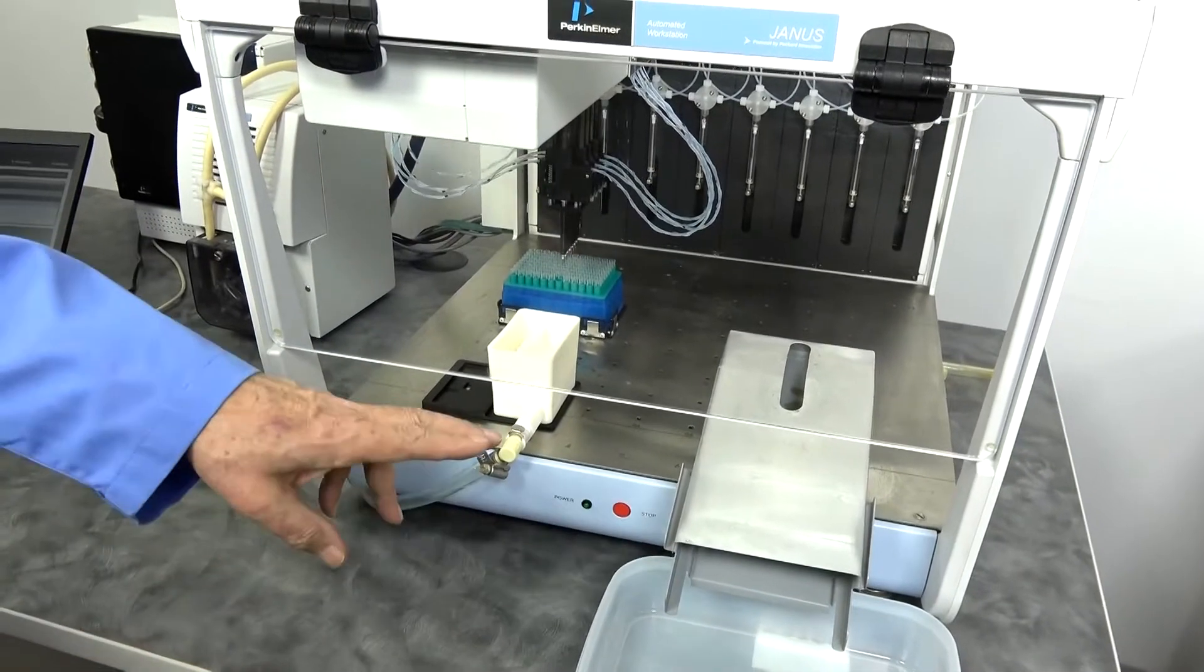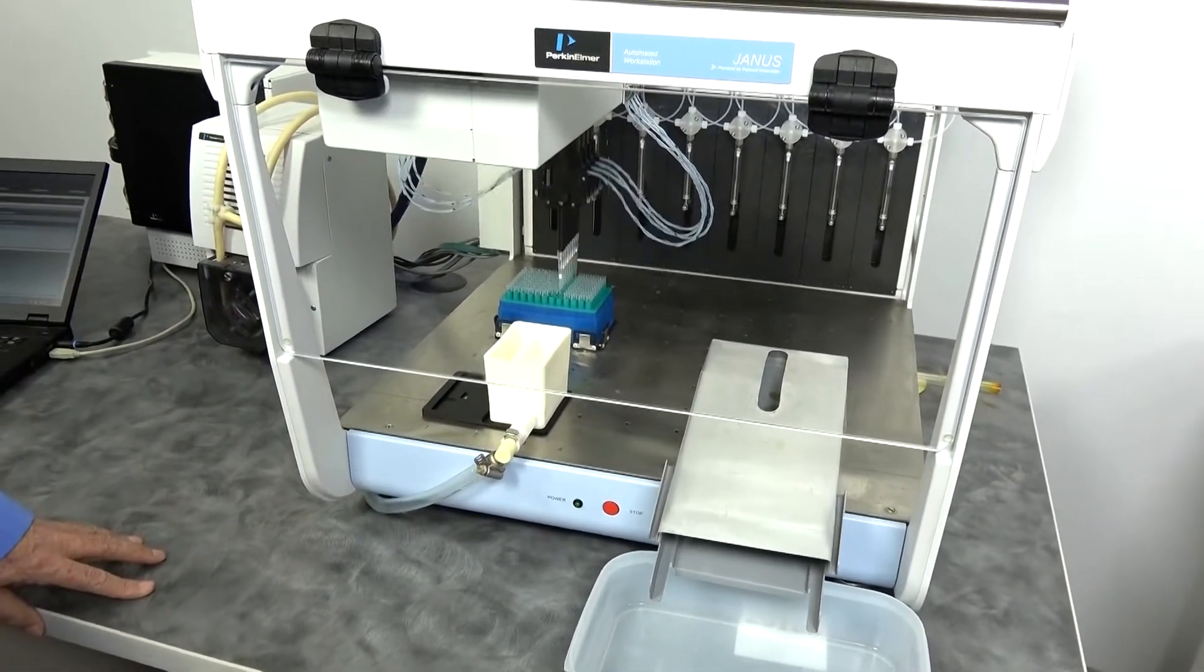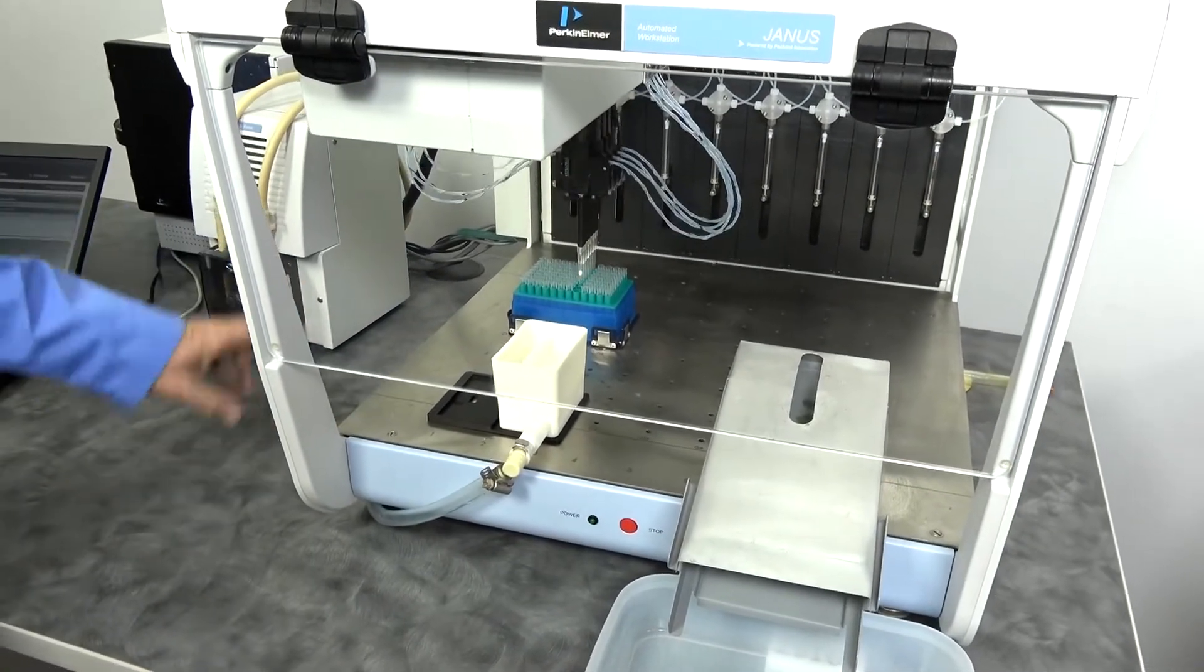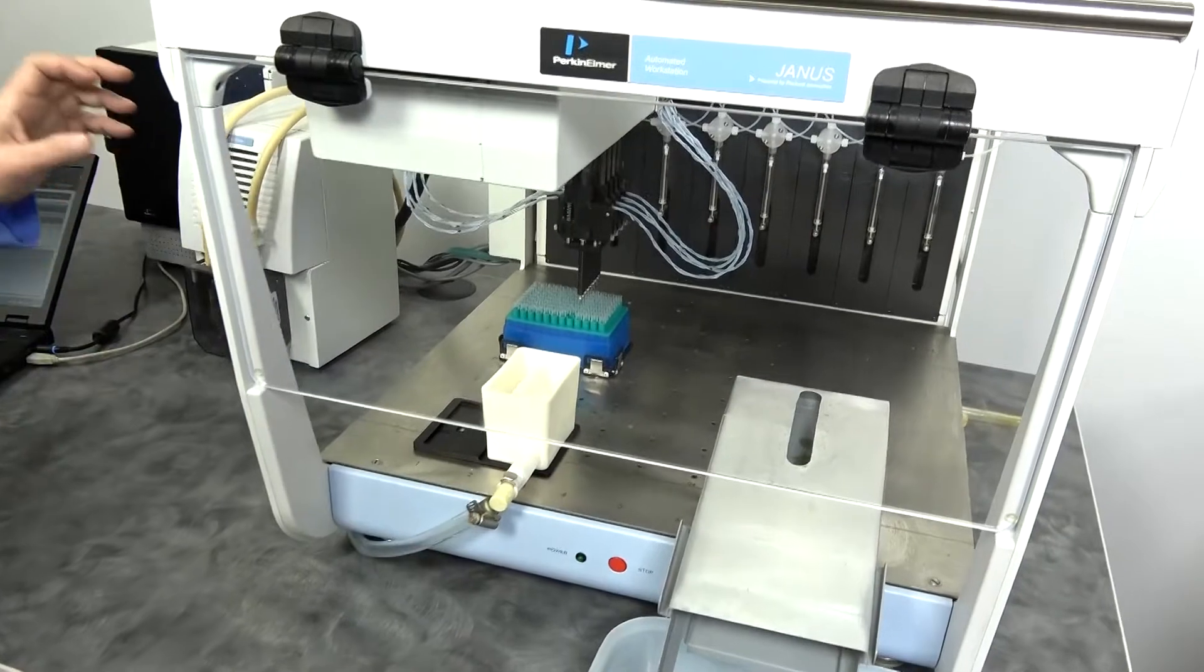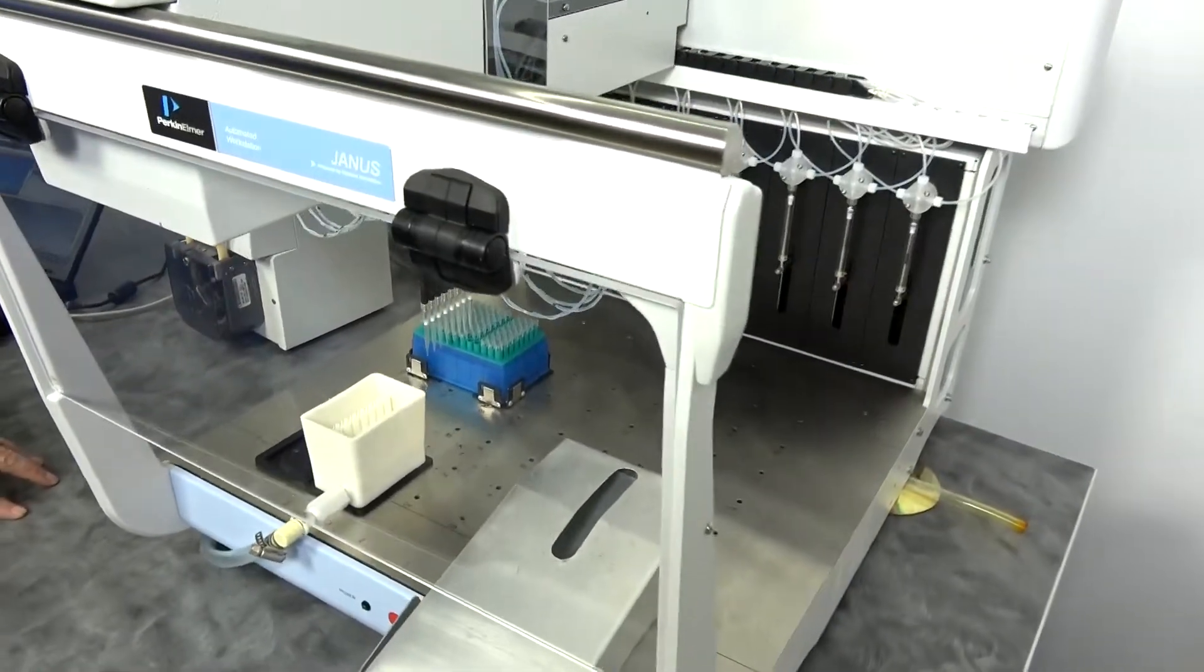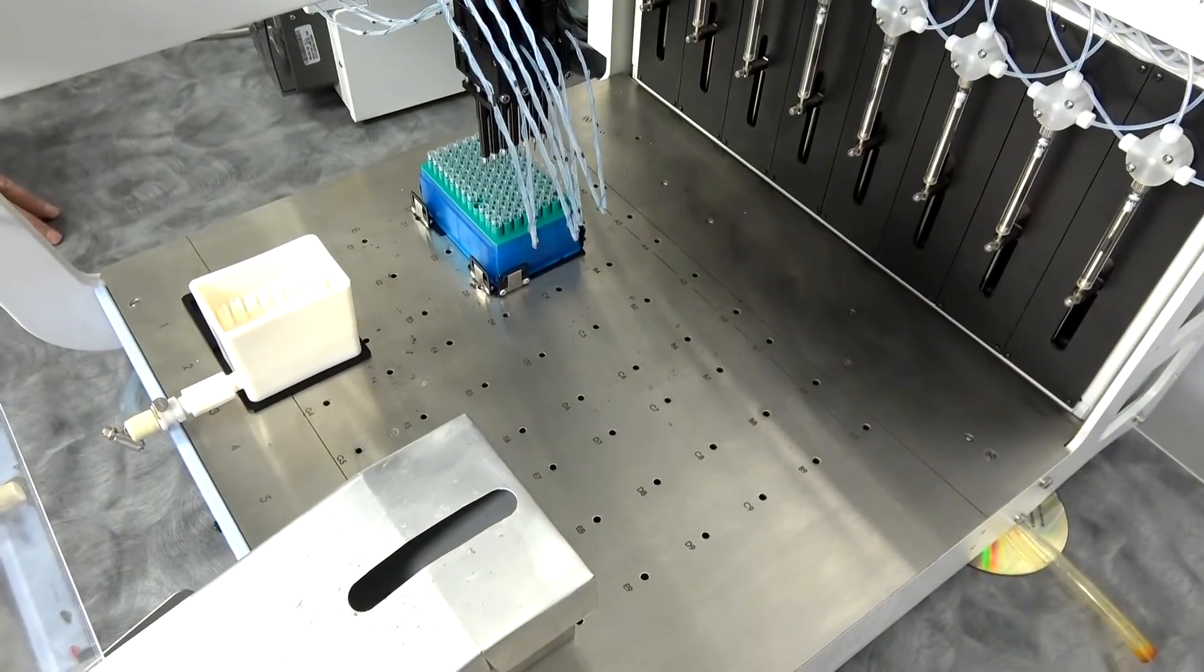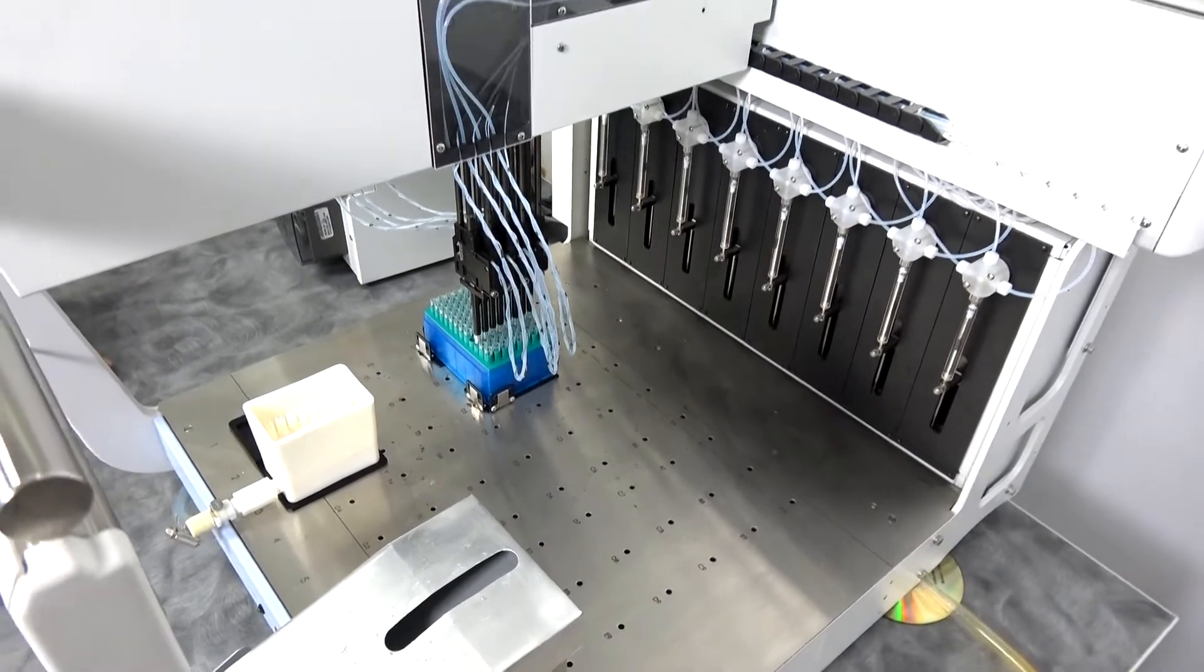Of course, the chute, the tip chute, well plates. There are different sized well plate holders and several different sizes of tips available. Shakers and all sorts of things available for these units.